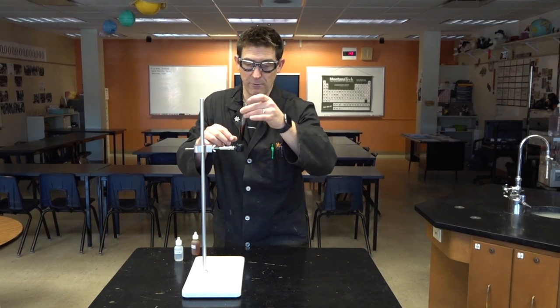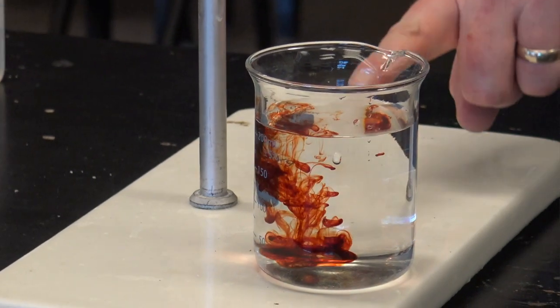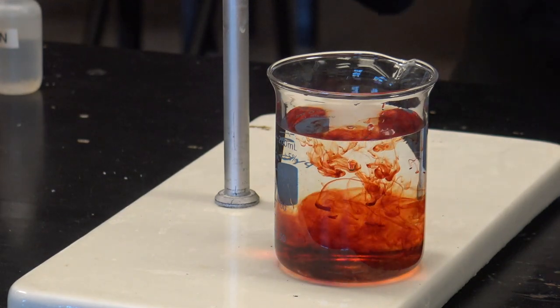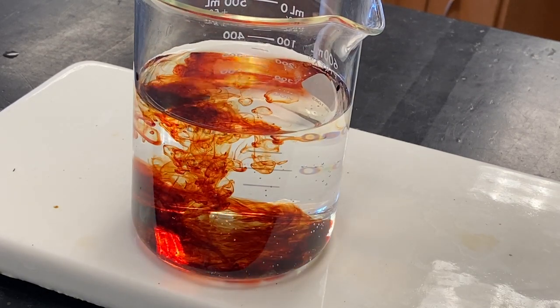It's a whole lot easier to see if we put this in some water. So next step, we'll add water. I love it.